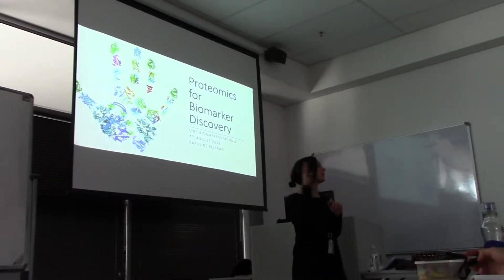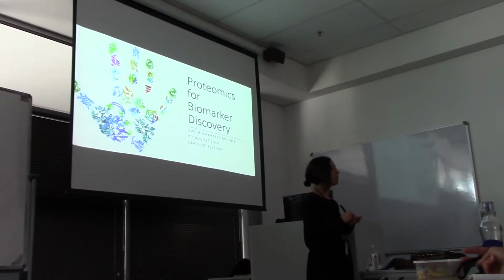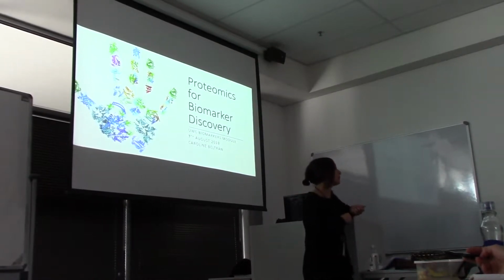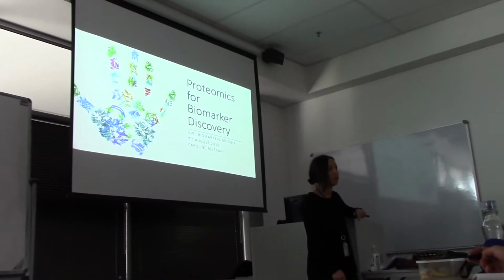And when we do the case studies much later on, I'll try and include a really good plant proteomic study that was done with SRM, which someone suggested. I don't know if it's anyone in this room, or if it was one of the seniors, but we'll go through that and discuss how these proteomic studies hold up compared to other biomarker assays.